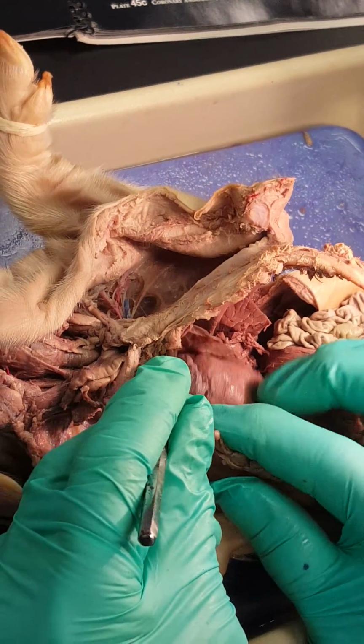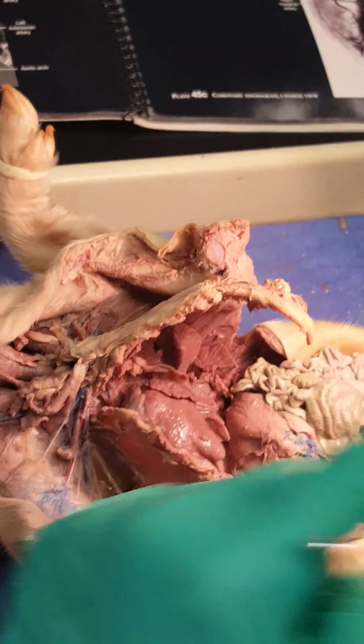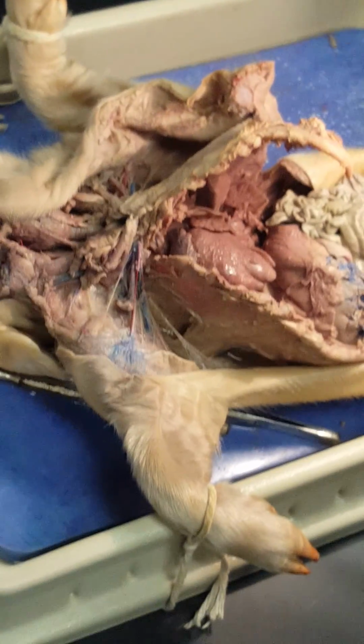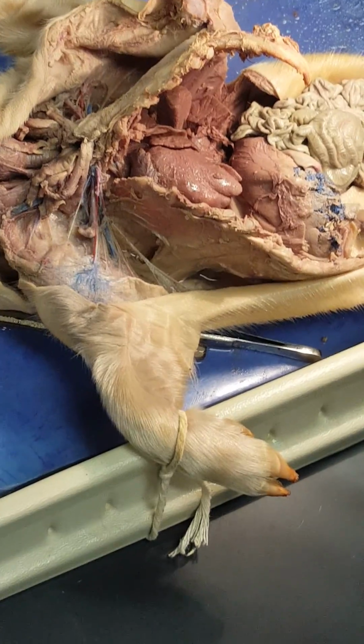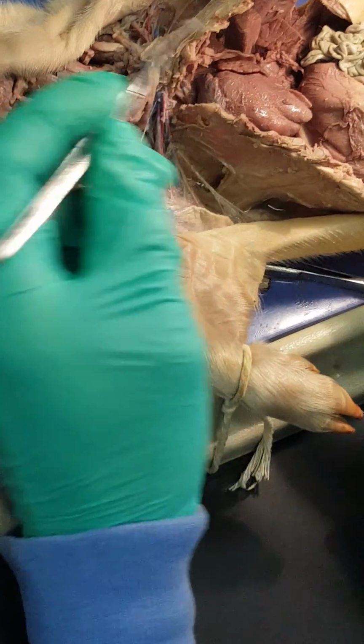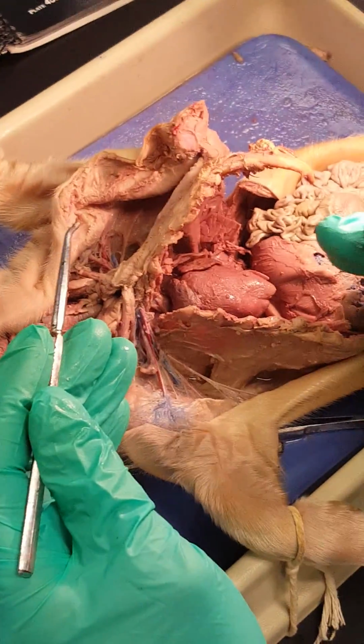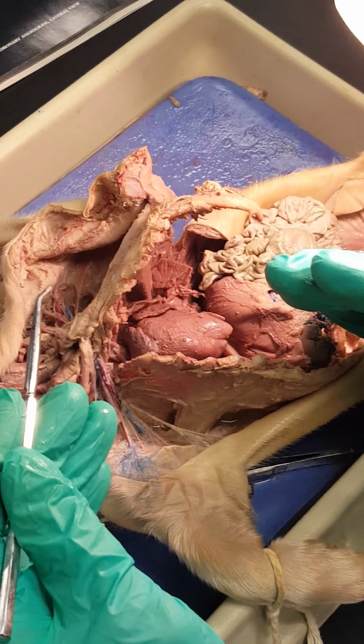The other connection is right here where the pulmonary trunk crosses the dorsal aorta. There's a little duct running between, called the ductus arteriosus. It allows blood being squirted out from the right ventricle to go out to the system. So we pretty much bypass the whole pulmonary circulation.